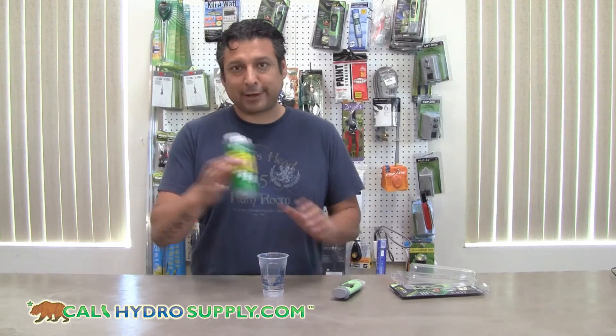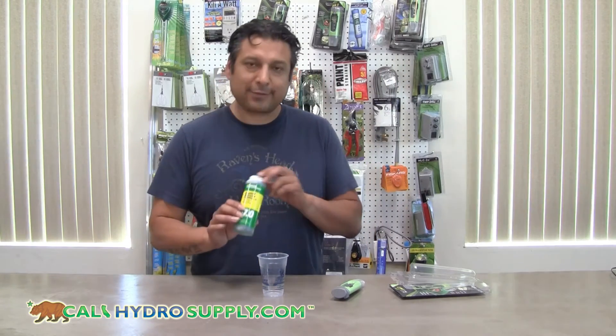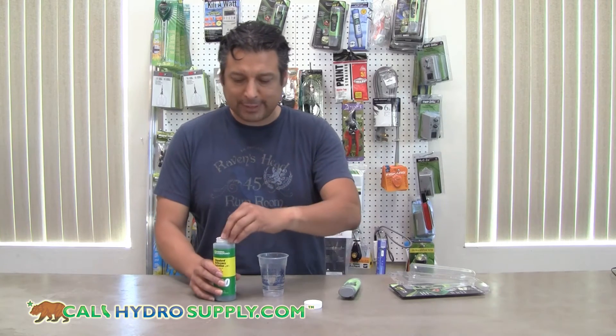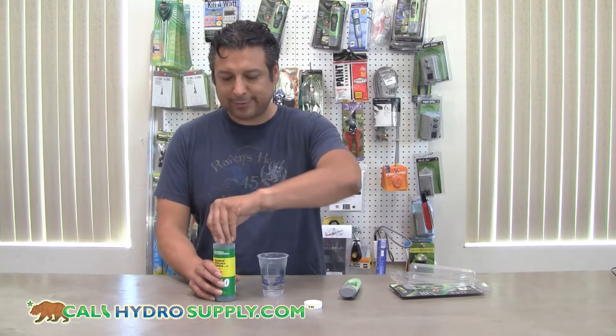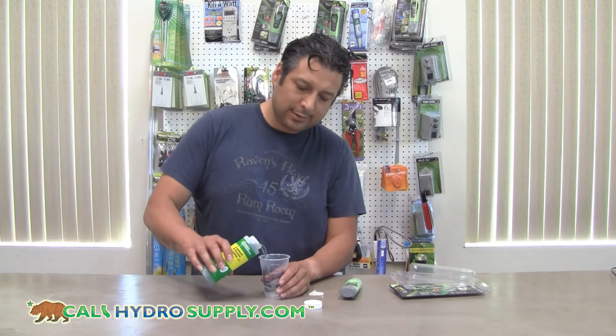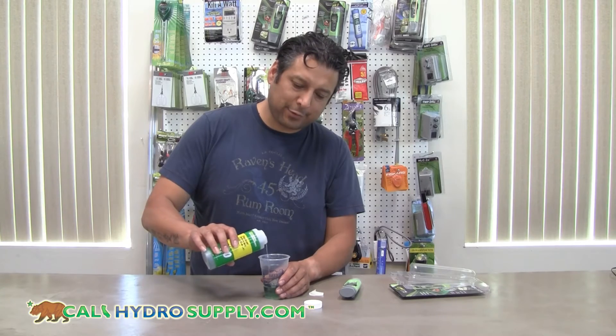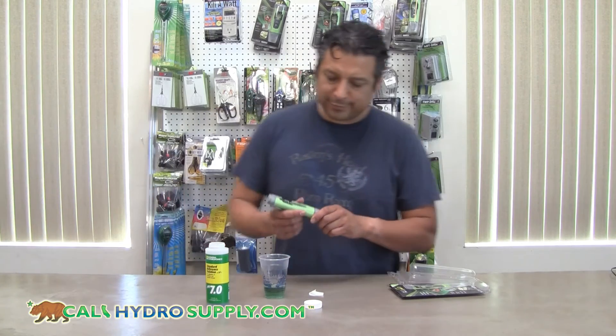What you'll first do is take your calibration solution. In this case we're going to be using 7.0. Get a disposable cup or something that you can put the solution in, pouring just enough that will cover the probe all the way when you submerge it.